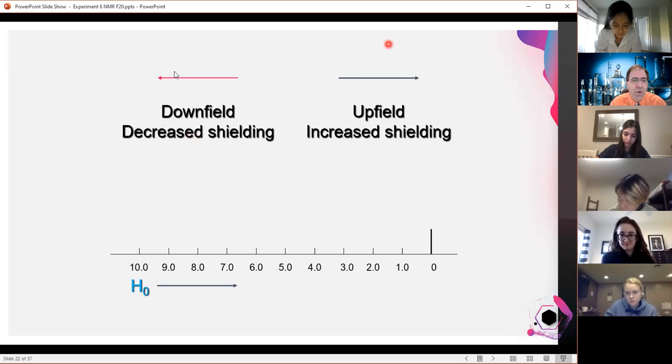But some terms here you want to get straight, because these just get used all the time in NMR. If something is upfield, it has increased shielding, that's to the right. If something is downfield, it's decreased shielding. Down is decreased, two Ds there, and that's to the left. So we'll say this is downfield of another signal. Or it's near something that's electronegative, so it's decreased the shielding, and therefore it shifts downfield. So more electronegative moves you more towards the left here.